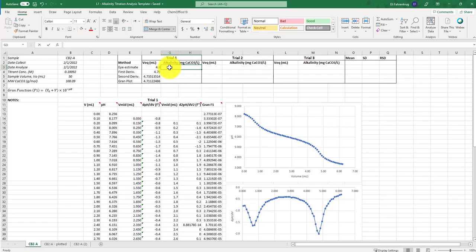I'm not going to do that for you because I think that's something that you can determine on your own based on the stoichiometry of the reaction here and the known equivalence volumes that you've computed. And then, of course, you would want to do this several times so that you could compute an average, a standard deviation, and a relative standard deviation. And these values compared with other classmates' values or known values will allow you to make assertions about things like the precision of each of these analyses, the precision of your experimental method, the accuracy of your method, etc.